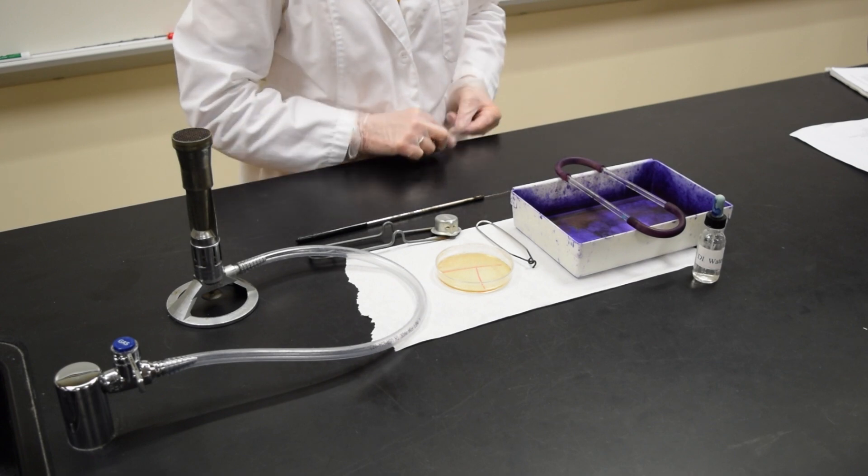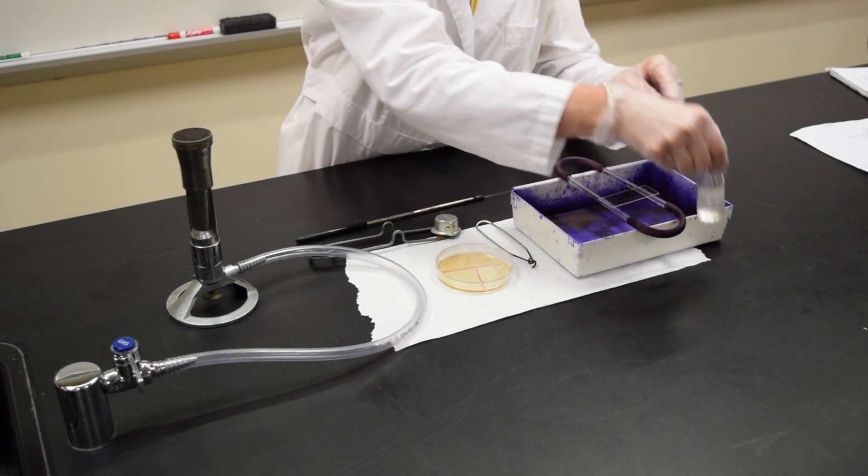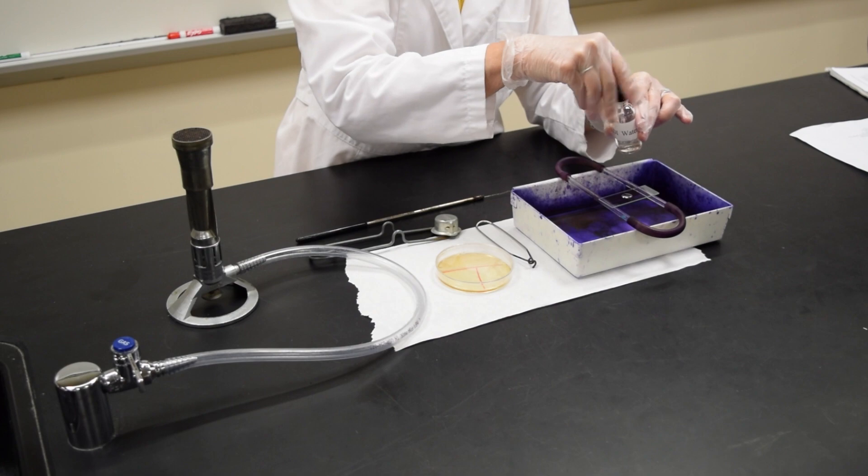You're going to take a slide and rest it on the rack. Put a drop of deionized water in the center of the slide.